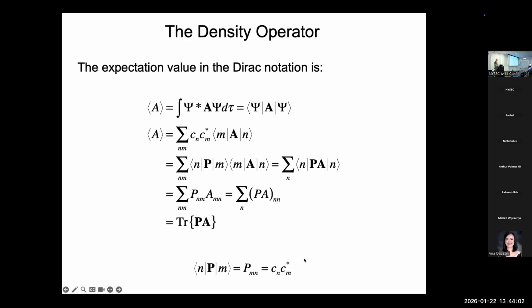So we'd be done, except we don't have a collection of identically prepared states. Our 10 to the 17th states in an NMR tube have to satisfy the Boltzmann distribution. So we need to generalize this idea to having a Boltzmann distribution. But of course, I've gotten one slide ahead of myself. So here, back up a bit, here's the expectation value.